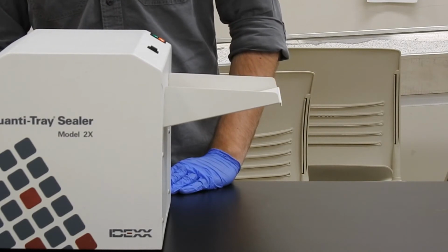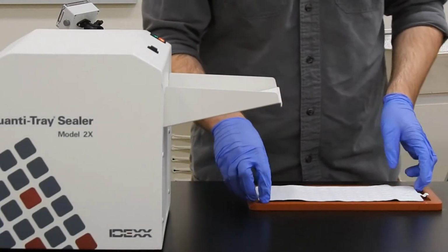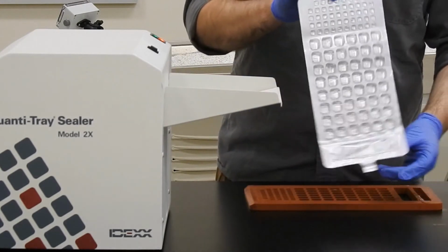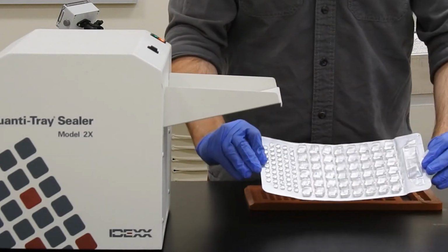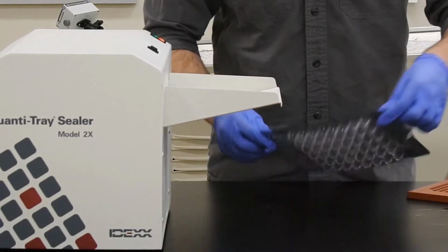And the sealer seals all the way around the edges, so that once it's sealed, there's no risk of spilling anything. There we go. So I'll demo that now. You'll see me pull it out and turn it upside down. There you go. No risk of spilling. And then you can kind of see that each tray is pretty much totally filled with water with some bubbles.